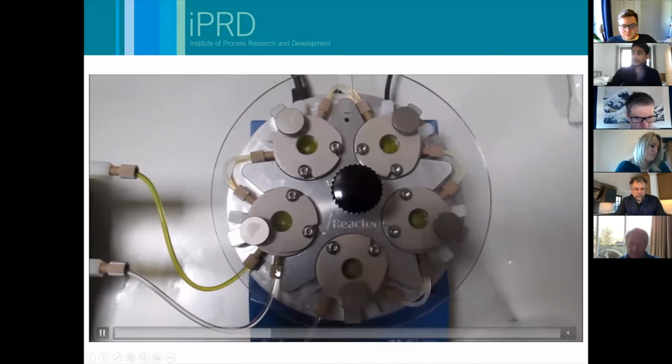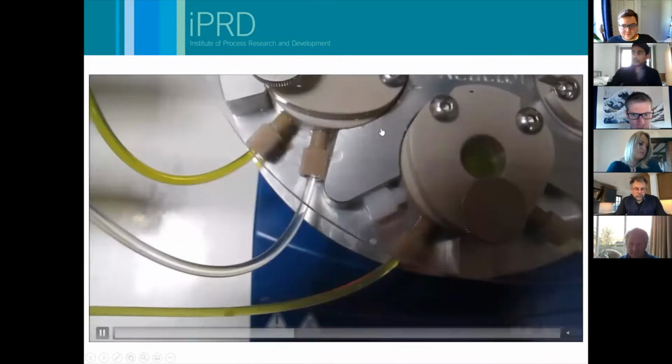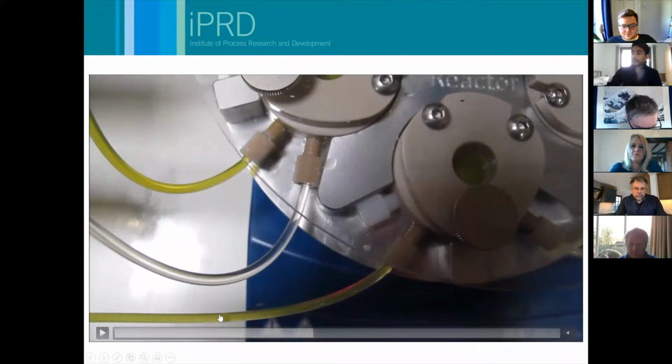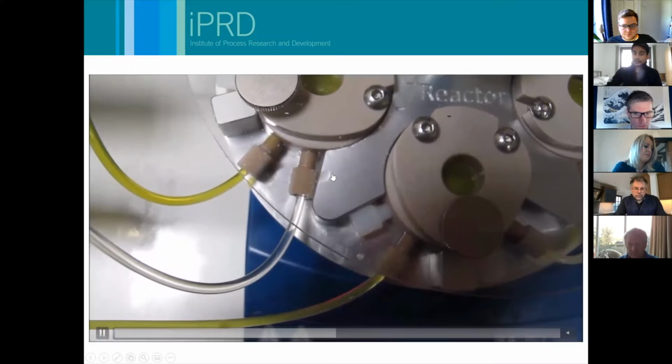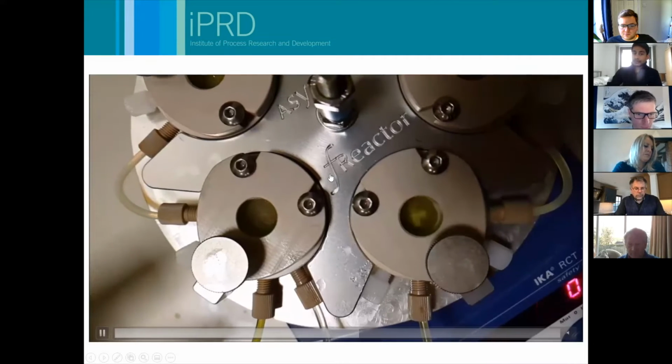You can see fluids coming in on the left-hand side, flowing their way around through these 5 stages. If I pause that there, you might be able to see, if your contrast is good enough, a very fine emulsion of material leaving after the last stage. That's a very typical physical operation. There's no real chemistry taking place, but it gives you a feel for what's going on.